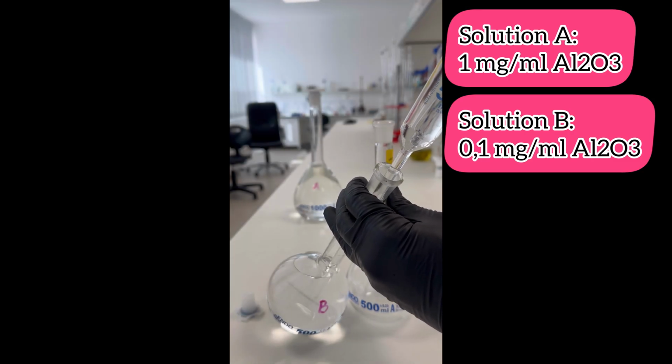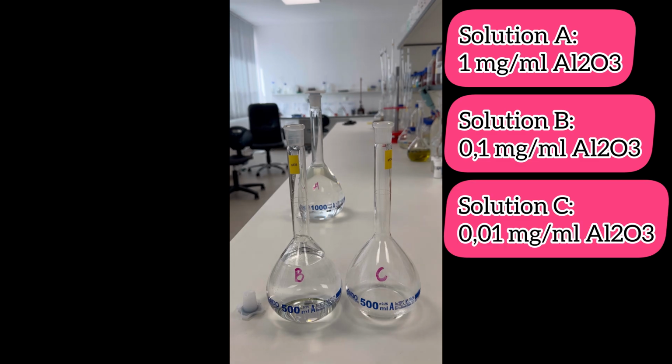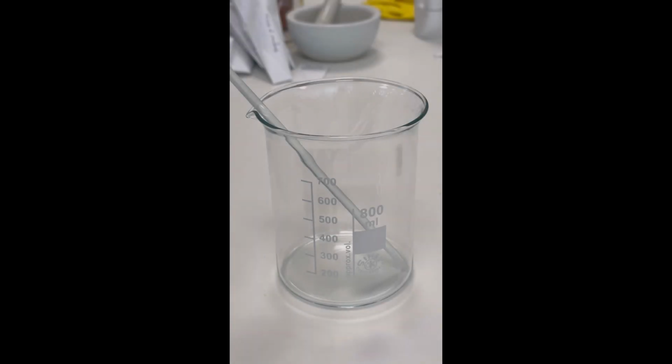Again, we pipette 50 milliliters of solution B and transfer it into another volumetric flask of 500 milliliters. This solution is denoted as C. Its aluminium oxide content is 0.01 milligram per milliliter. It is important to prepare it fresh on the day of use. After our standards are ready, we move forward to preparing the other solutions.